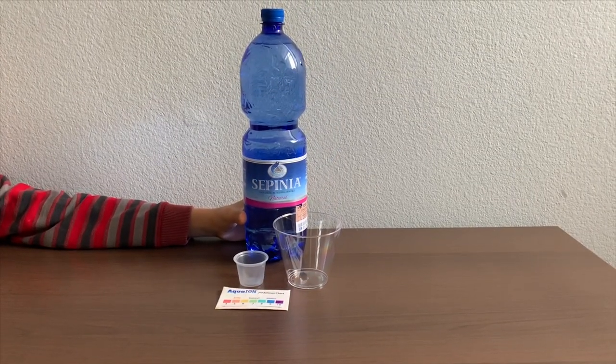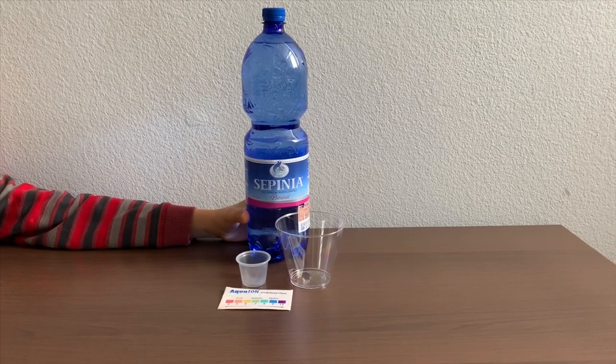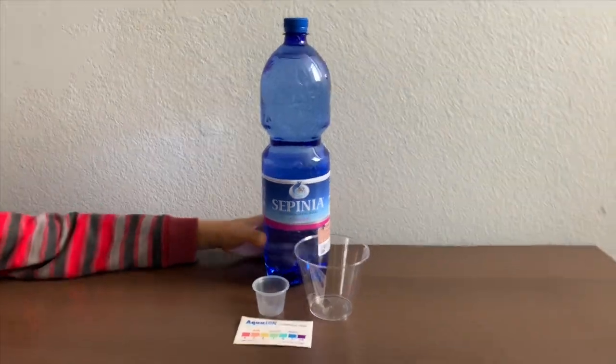This is the Sepinia Natural Mineral Water, sourced from Italy. It costs $1.99. You can find it at Ross. Let's test the pH and TDS level.